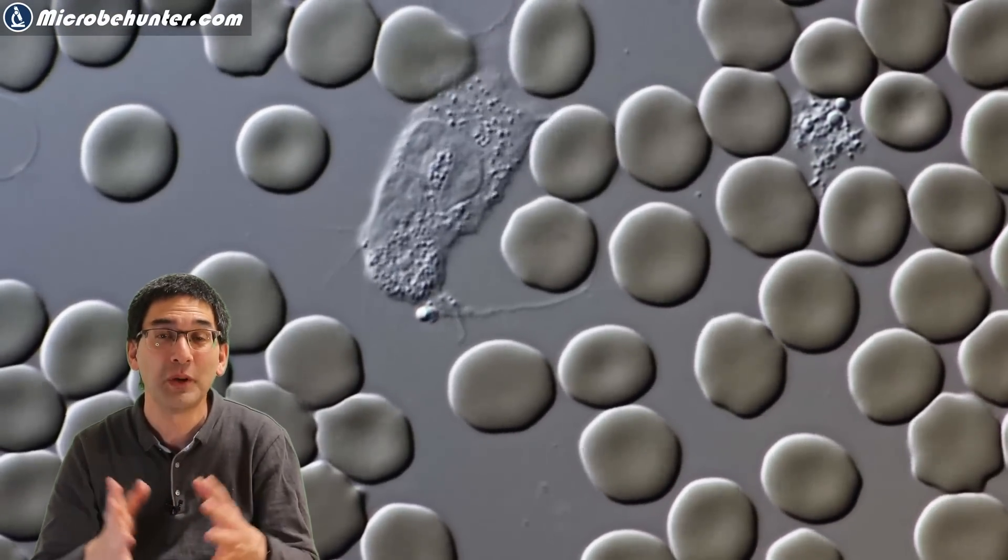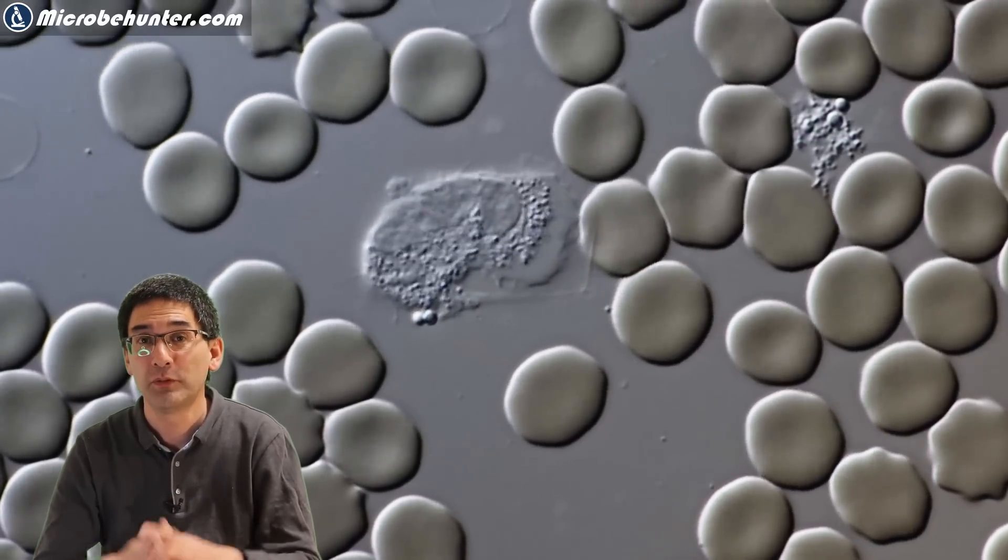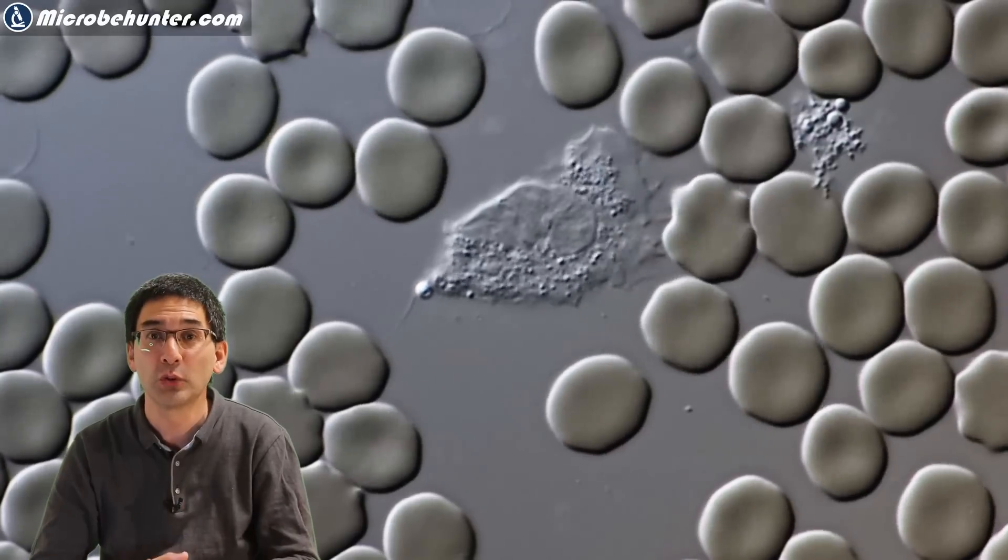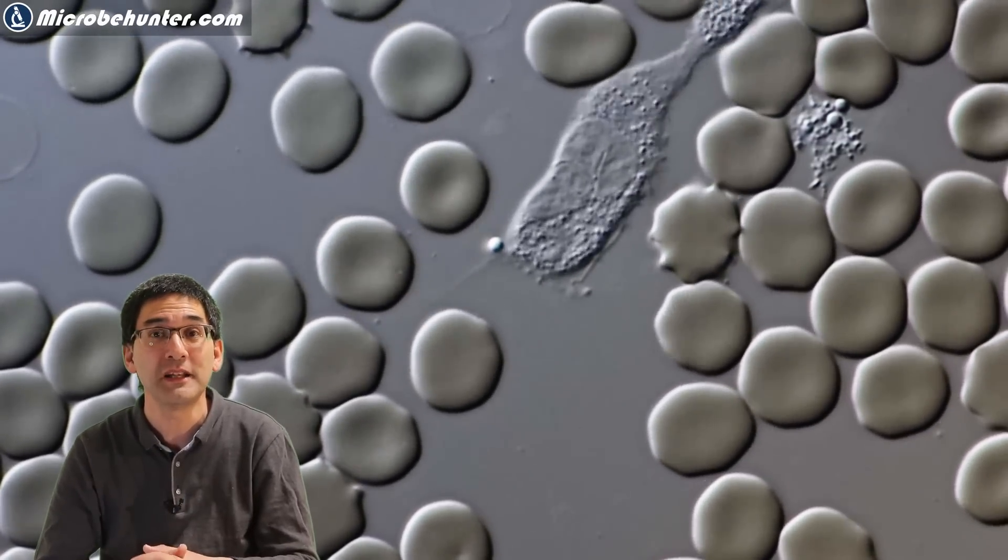If you want to observe them using your microscope, do use a relatively high magnification of around, let's say, 400 times total magnification. I've been using here, as a matter of fact, a thousand times magnification, and then I even zoomed in even more in my video editing program.